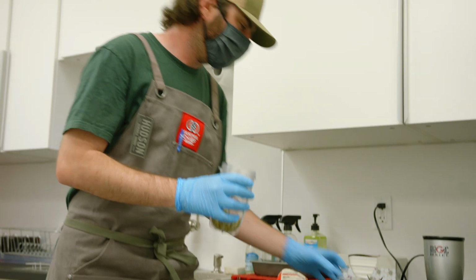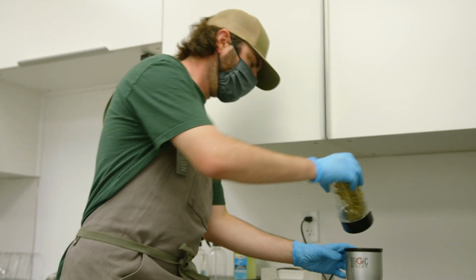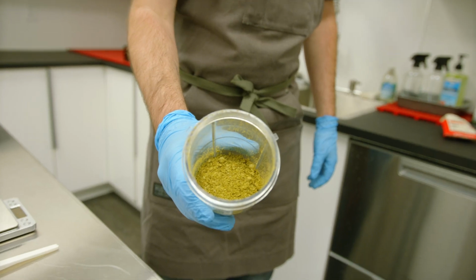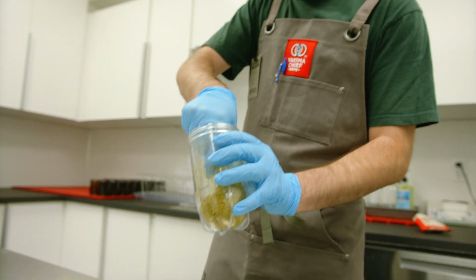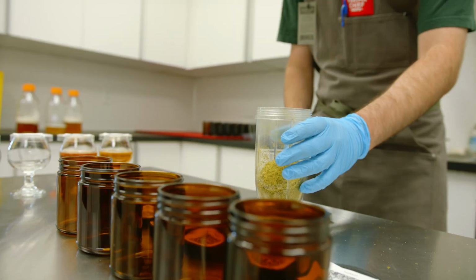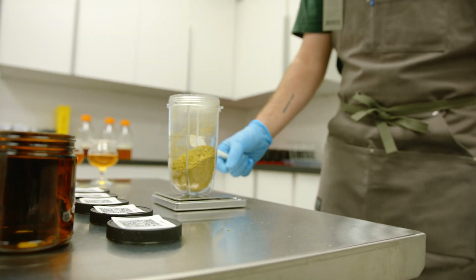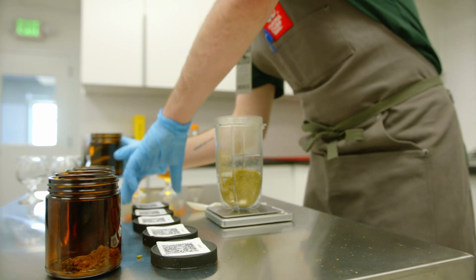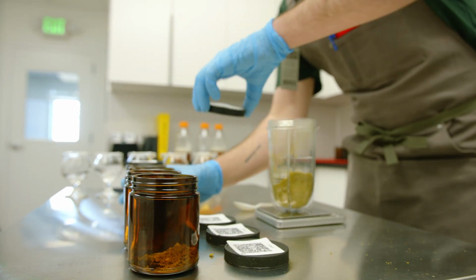Kevin is taking the sample and putting it into our little magic bullet. This is kind of the best way that we've found to grind up a pellet and make it easier to smell. The next step is to fluff it up, make sure that it's uniform so that we don't get any weird distribution of hop material in there. And then we weigh it out into the individual amber jars that panelists will use to assess the hops. All right, so we've got all of our samples measured out. Now all that's left is to screw on the lids and send them through to the panelists.